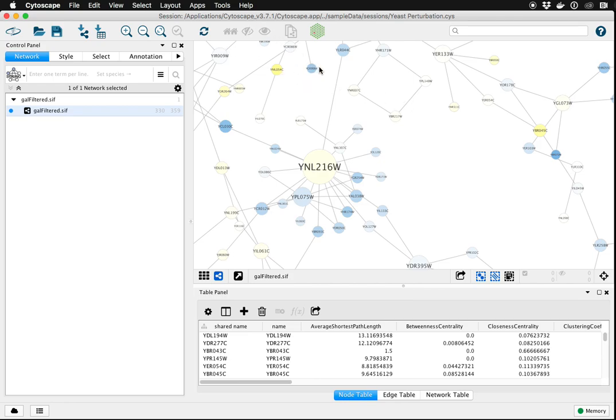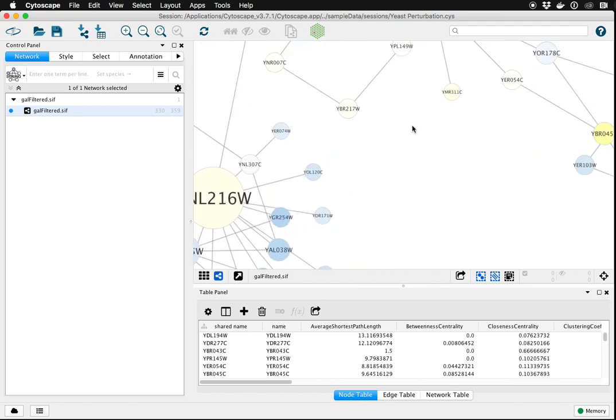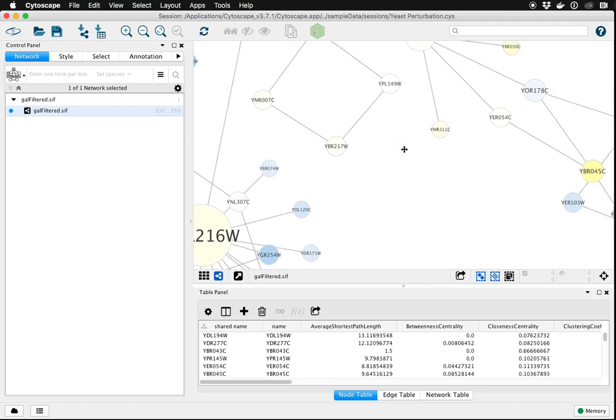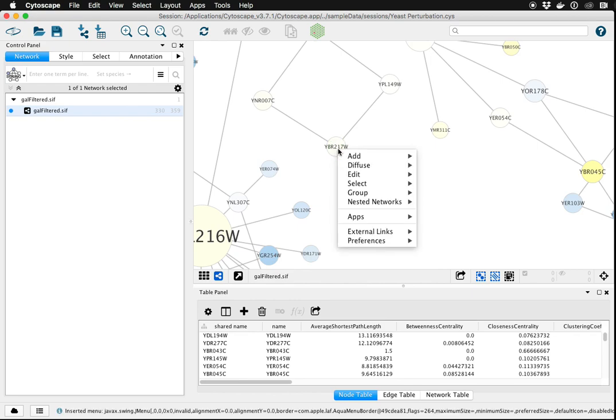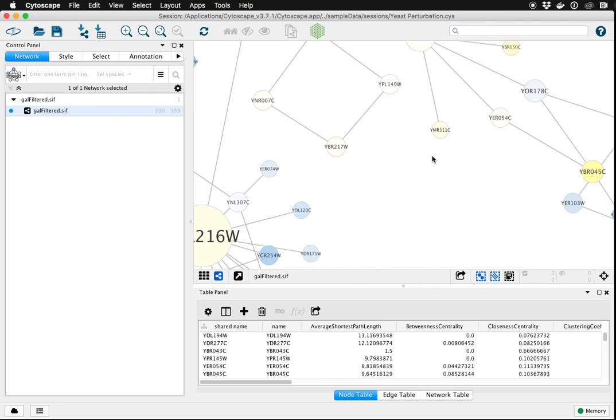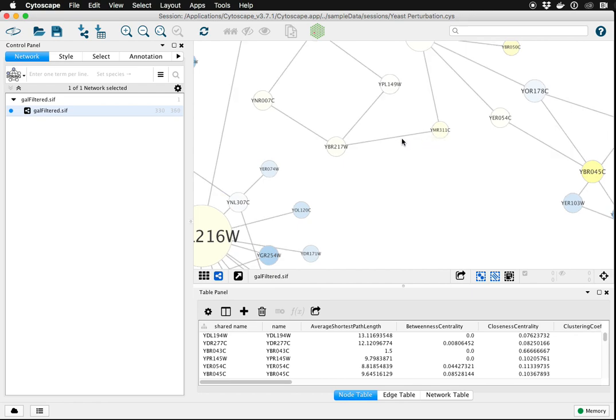Here we have an existing network. I'm going to zoom in and add an edge between two existing nodes. Right-click on one of the nodes, choose Add Edge, and you'll have the beginning of a new edge. You just need to click on the target node to establish a completed edge.